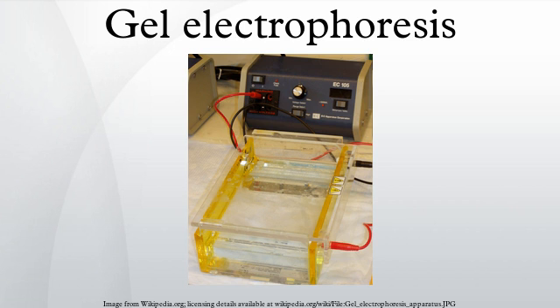Electrophoresis refers to the electromotive force that is used to move the molecules through the gel matrix. By placing the molecules in wells in the gel and applying an electric field, the molecules will move through the matrix at different rates, determined largely by their mass when the charge-to-mass ratio of all species is uniform. However, when charges are not all uniform, then the electrical field generated by the electrophoresis procedure will affect the species that have different charges and therefore will attract the species according to their charges being the opposite. Species that are positively charged will migrate towards the cathode, which is negatively charged. If the species are negatively charged, they will migrate towards the positively charged anode.